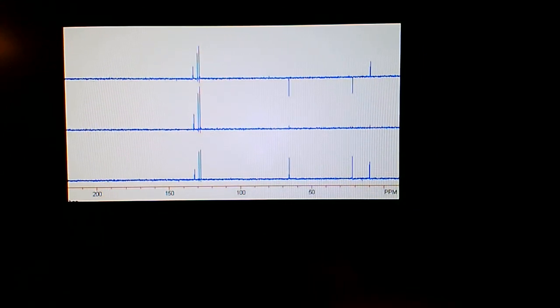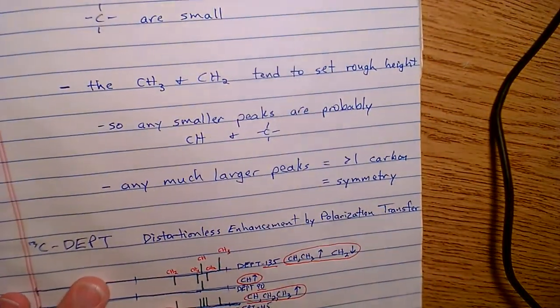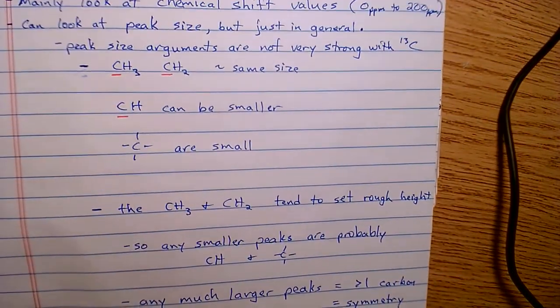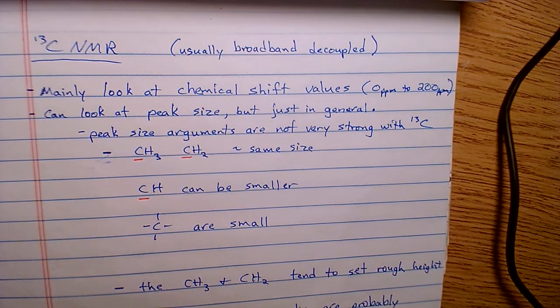So there is our brief look into carbon-13 NMR and DEPT. I think you can see that adding DEPT into our carbon-13 repertoire is really going to be very helpful to us. And anytime we're in the lab and we've got a sample that's good enough to run carbon-13 NMR on, is concentrated enough, we will run DEPT too, because that will give us so much more information.